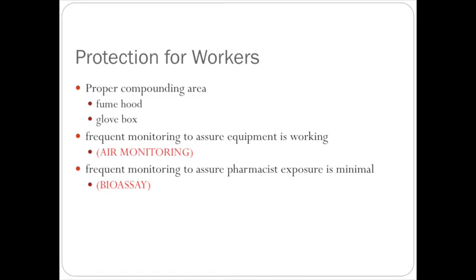And if we find out that you are, then we can do things to try to adjust your technique, or double check the equipment, or try to figure out where the source of the radioactive iodine inhalation actually occurred.